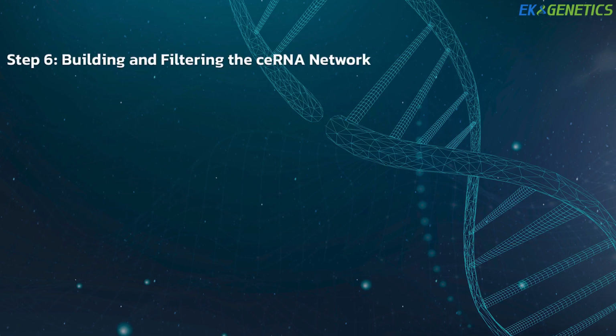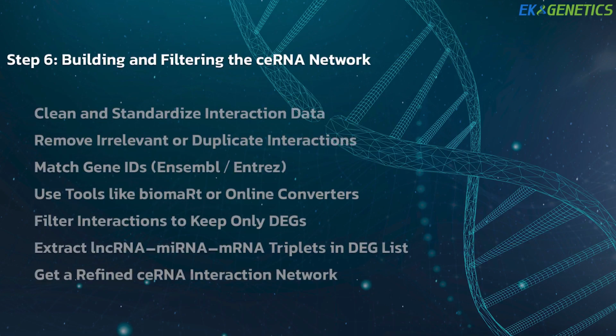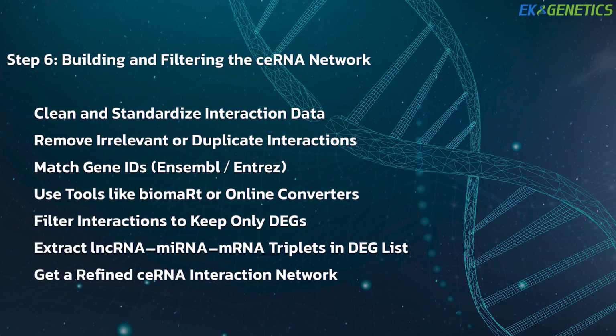Step 6. Building and filtering the ceRNA network. At this stage, you have all the interaction files downloaded and cleaned, but data cleaning is critical before filtering. 1. Cleaning and standardizing the data. Remove interactions that are irrelevant or duplicated. Make sure the gene IDs match your DEG list.